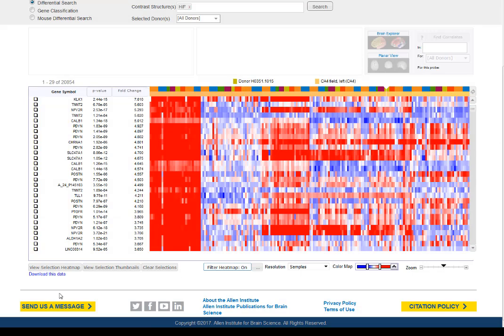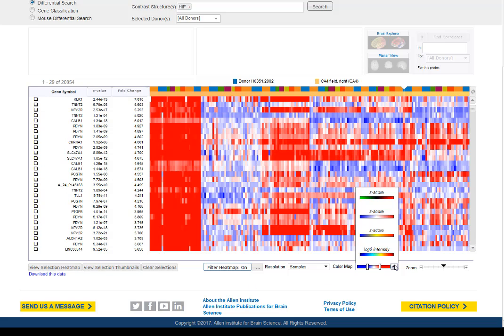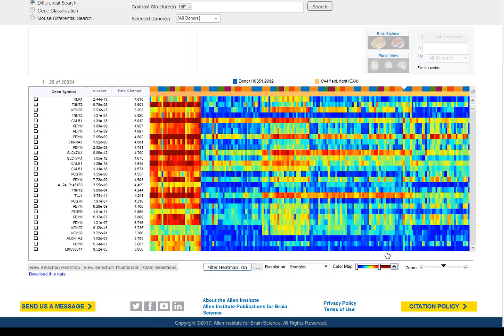To download this data, set up your heat map exactly as you want your data matrix to look, and make sure you choose the normalized data color map. You can download up to 2,000 rows at a time.